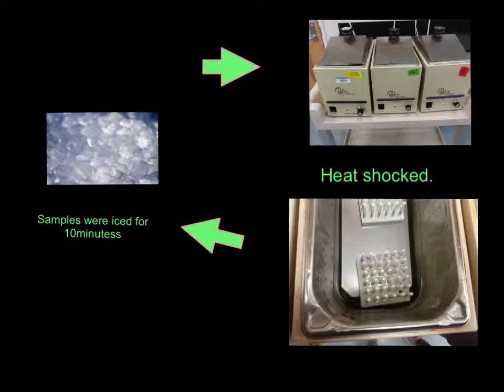First, each tube was placed in ice for 10 minutes. They were then heat shocked at 42 degrees Celsius. This was done for 90 seconds and allowed the uptake of foreign DNA into the E. coli. This is where the CaCl2 importance comes in. When you increase the salt, it increases the stress. And increasing the stress is very important for the heat shock stage. After 90 seconds of heat shock, they were immediately transferred into ice incubation for 2 minutes.